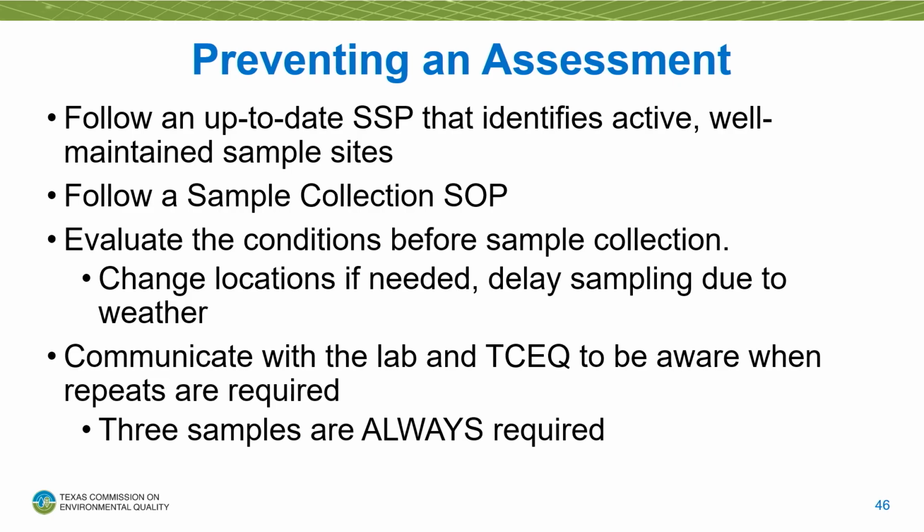You also want to monitor weather conditions prior to sample collection. If conditions are not suitable, you should delay your sampling. You want to avoid sampling from a site that is unsanitary, has a residual below the minimum, or has waterline construction, as all of these situations can lead to positive samples.